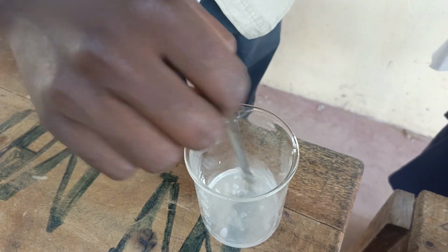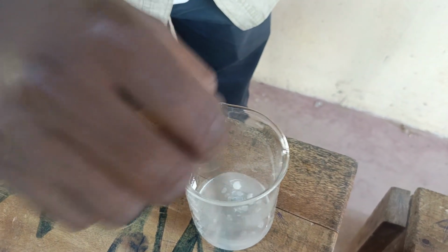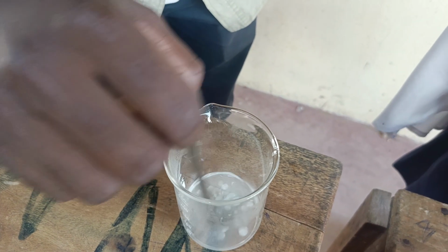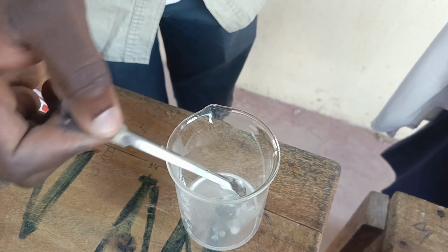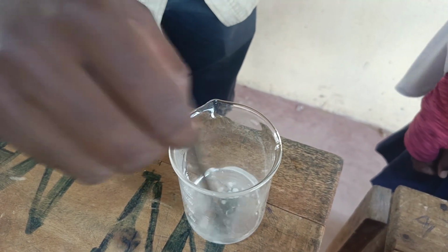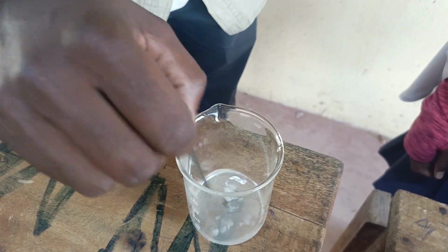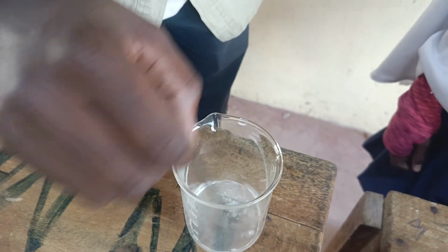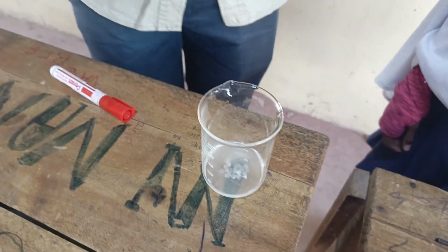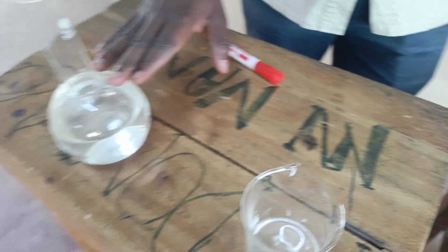So what I am doing, I'm just stirring this sodium hydroxide to make sure it's in solution form so that we can test it using our litmus papers. You can use a stirring rod. I have just used a spatula to stir because it cannot react with my spatula, but for other solutions it's advisable we use a stirring rod, right? Yes. So we have our base here and our acid here.